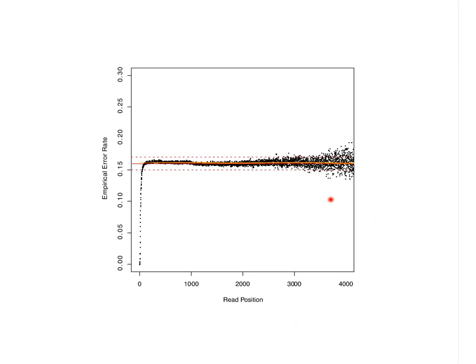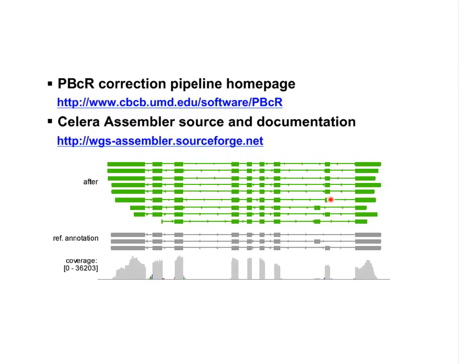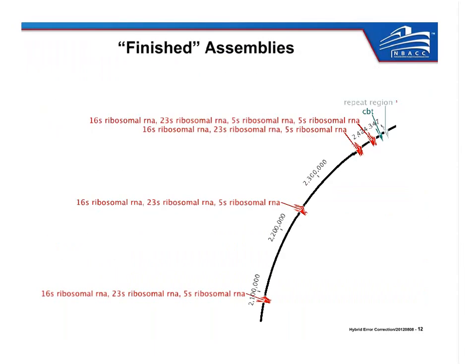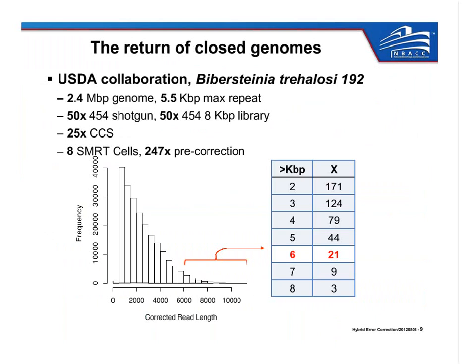The important part about that being a general, unbiased error rate is that it's easier to eliminate the errors when the error is unbiased, regardless of how severe the error is. In terms of the read length distribution, it's essentially an exponential decay function, because the read lengths depend on the survivability of the polymerases, and as they're exposed to the laser light, they gradually die.